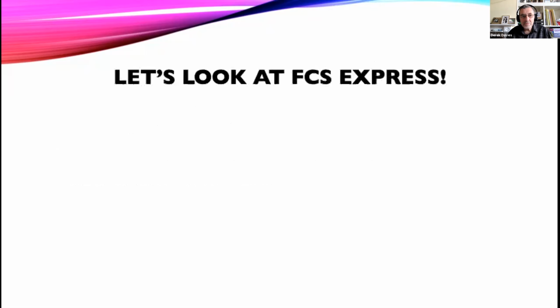So today we're going to be using FCS Express, and Rui is going to be running this. And as he said, his computer may be a little slow, so we might have to swap between his and Kathy's. We'll see how we get on. Rui, I hope you're still there. I'm going to hand over to you. I'm going to stop my share. Yes, I am here.